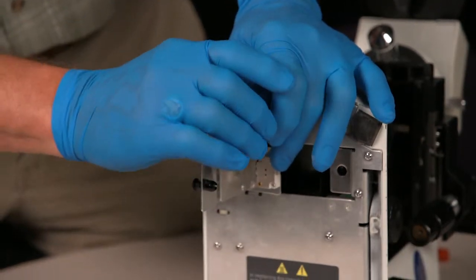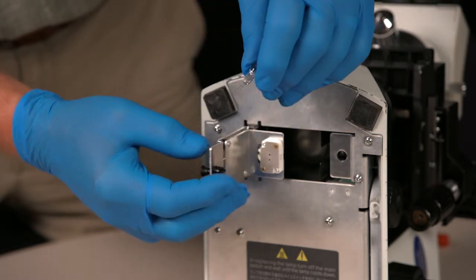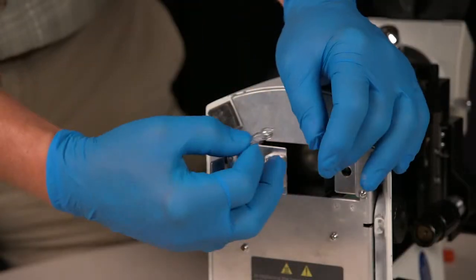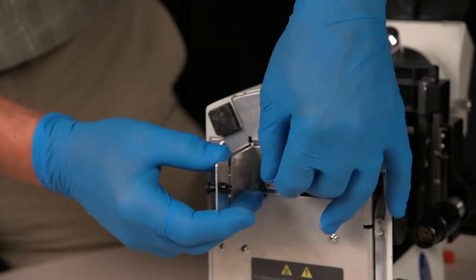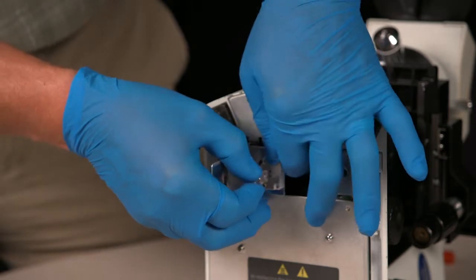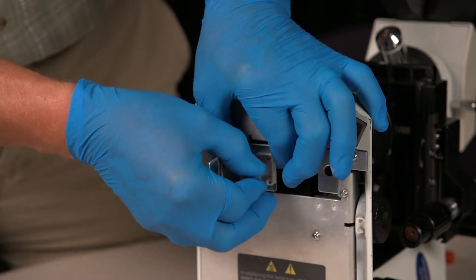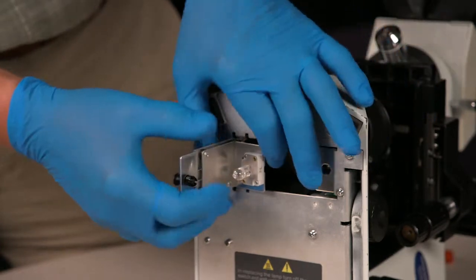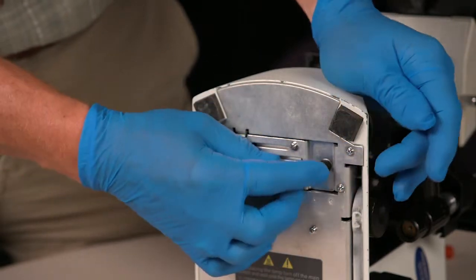When you install the new bulb, make sure the bulb is covered, clean, either gloves, do not touch with your hands. This bulb can be installed either direction, just so that the pins match up the hole here and your hands are not touching the bulb directly. Insert into the lamp socket and then close the access door.